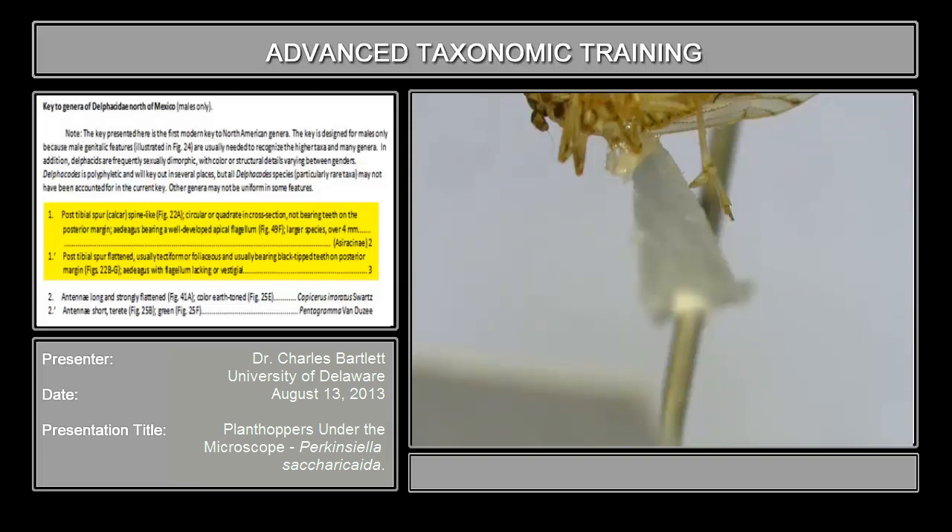The calcar is spine-like, circular or quadrate in cross-section, not bearing teeth on the hind margin, as opposed to post-tibial spur flattened, usually tectiform — which is tent-like — or foliaceous — which is leaf-like — usually bearing black-tipped teeth on the posterior margin.